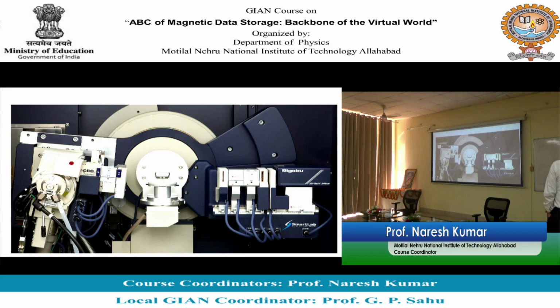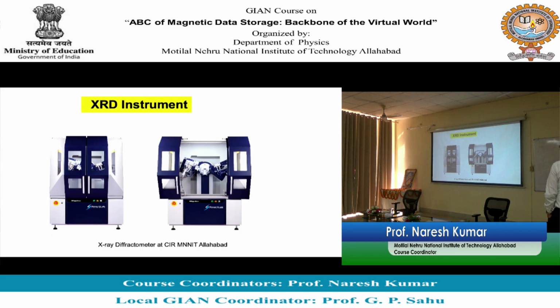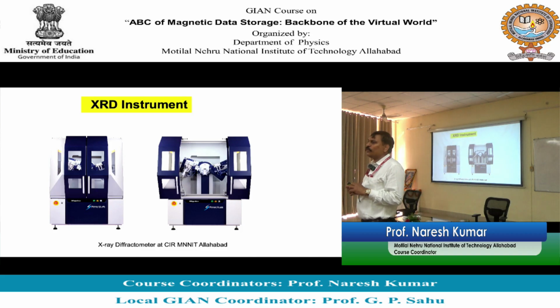This is the XRD that we have with us in CIR. Same वो भी मैं दिखा रहा था. Sample holder, X-ray source, detector. मैं एम्फेसाइज कर देता हूँ आपको इस बात पे. X-rays are not good for human beings, है ना? Exposure to X-rays. अच्छा, एक्सरे छोड़ दीजिए, कोई भी रेडिएशन हमारे लिए अच्छा नहीं है. Exposure to X-ray is not good for human beings.